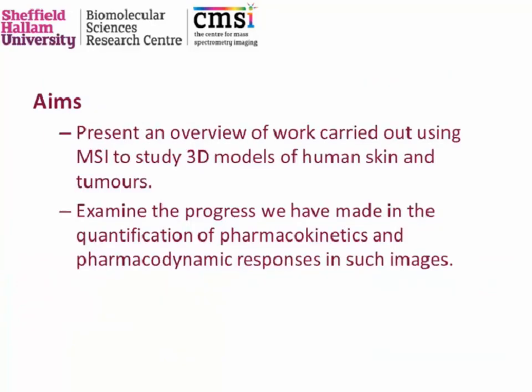The overall aim of the talk is to present an overview of all this work and talk about why the combination of mass spectrometry imaging with 3D cellular models is a happy marriage, and then to talk to you about some of the progress we've made in not just using the technologies to produce pictures of distributions of compounds, but also to quantify both pharmacokinetic aspects of the interaction between xenobiotics and the models and pharmacodynamic responses.